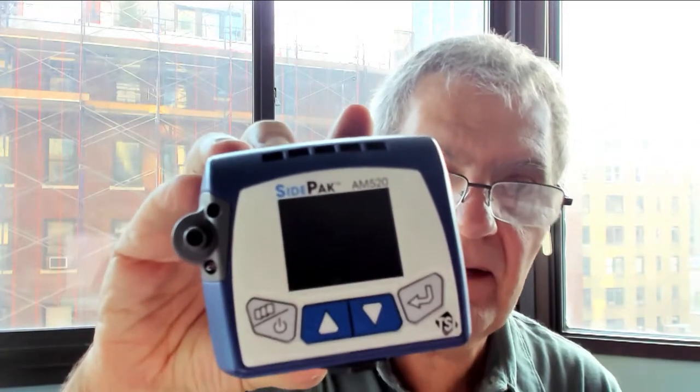Welcome everybody. I want to do a tutorial on the TSI SidePak model AM520. It's a very simple machine to use. It comes with an instruction guide and a quick start, so if you don't follow everything I'm doing now you can go back to that. There really is not much you could do to damage this.